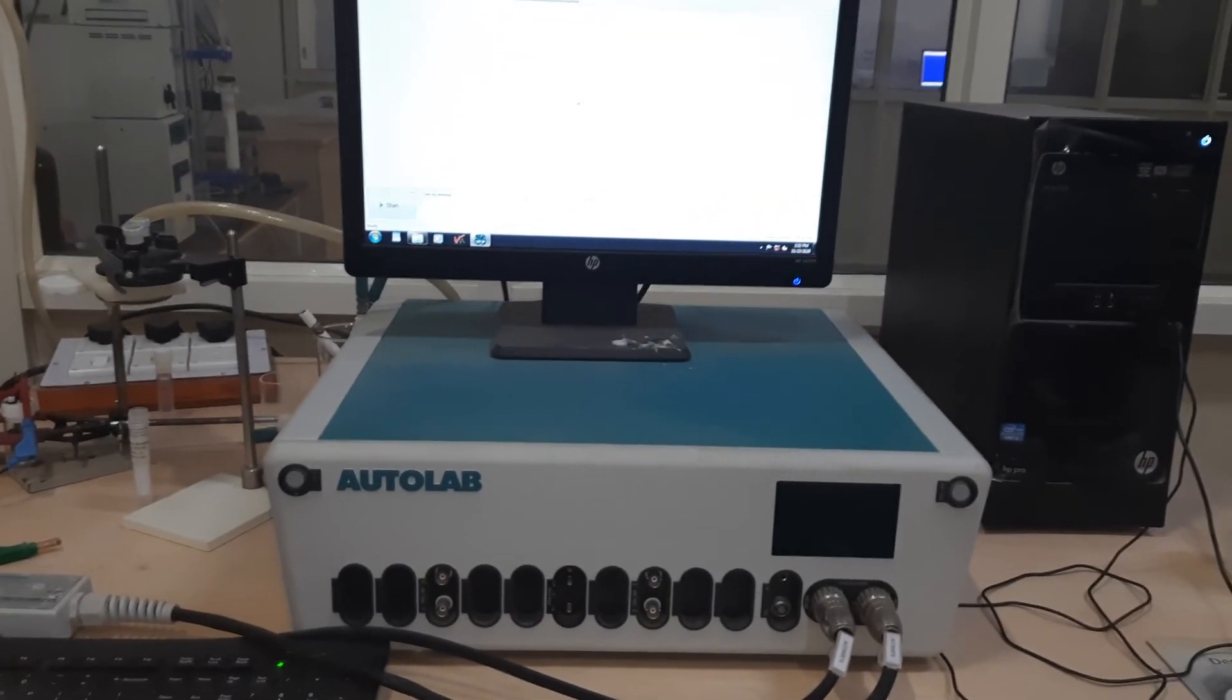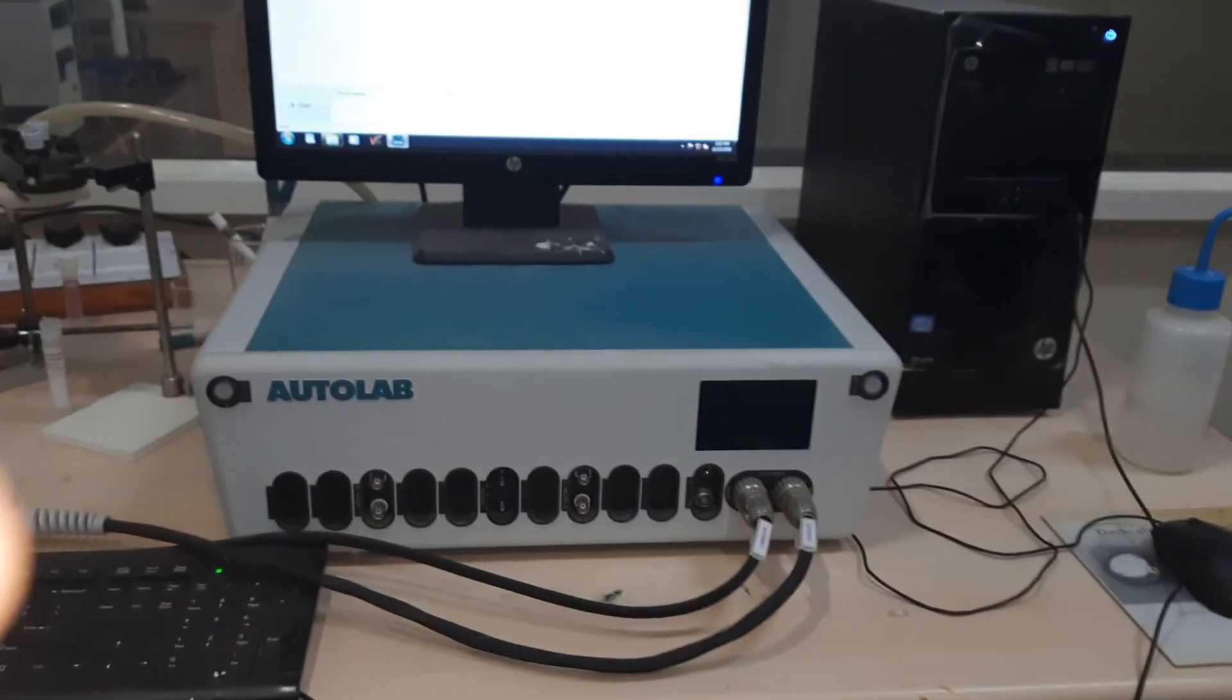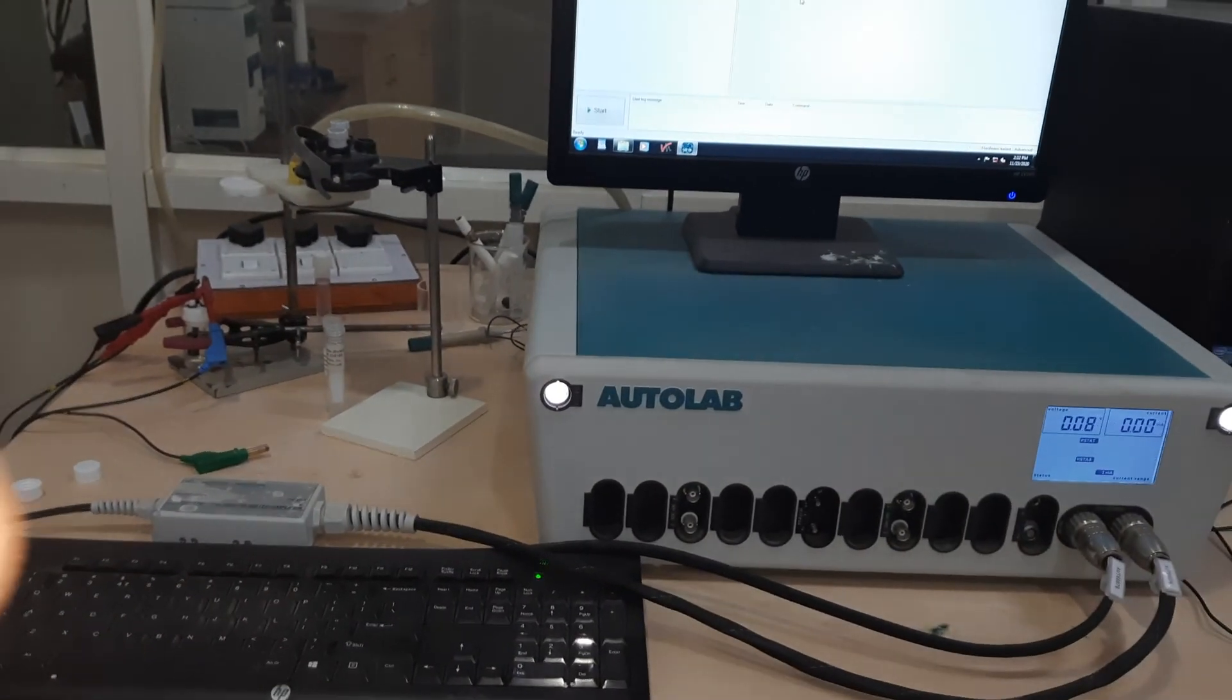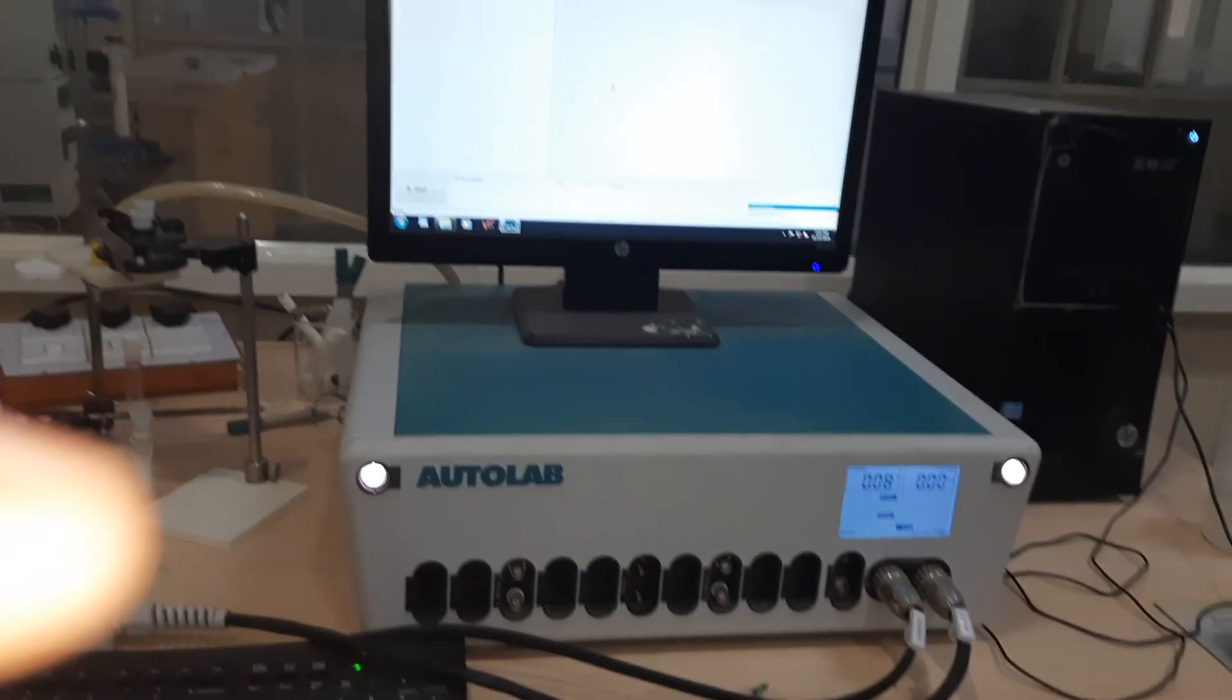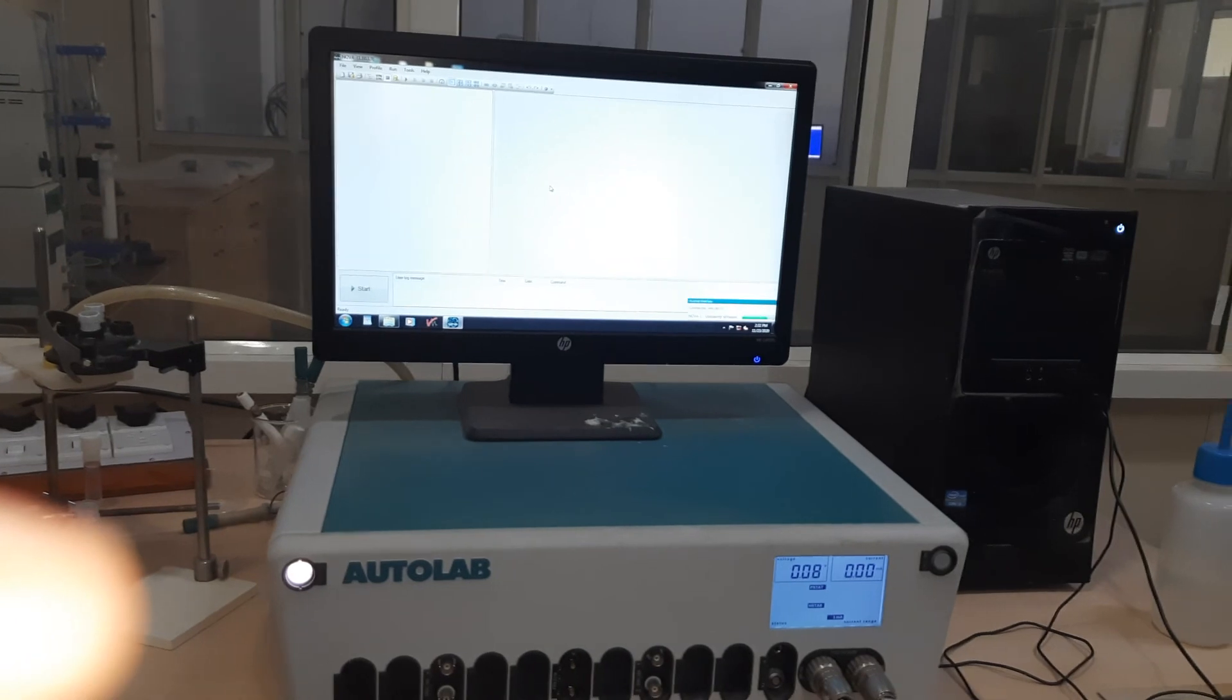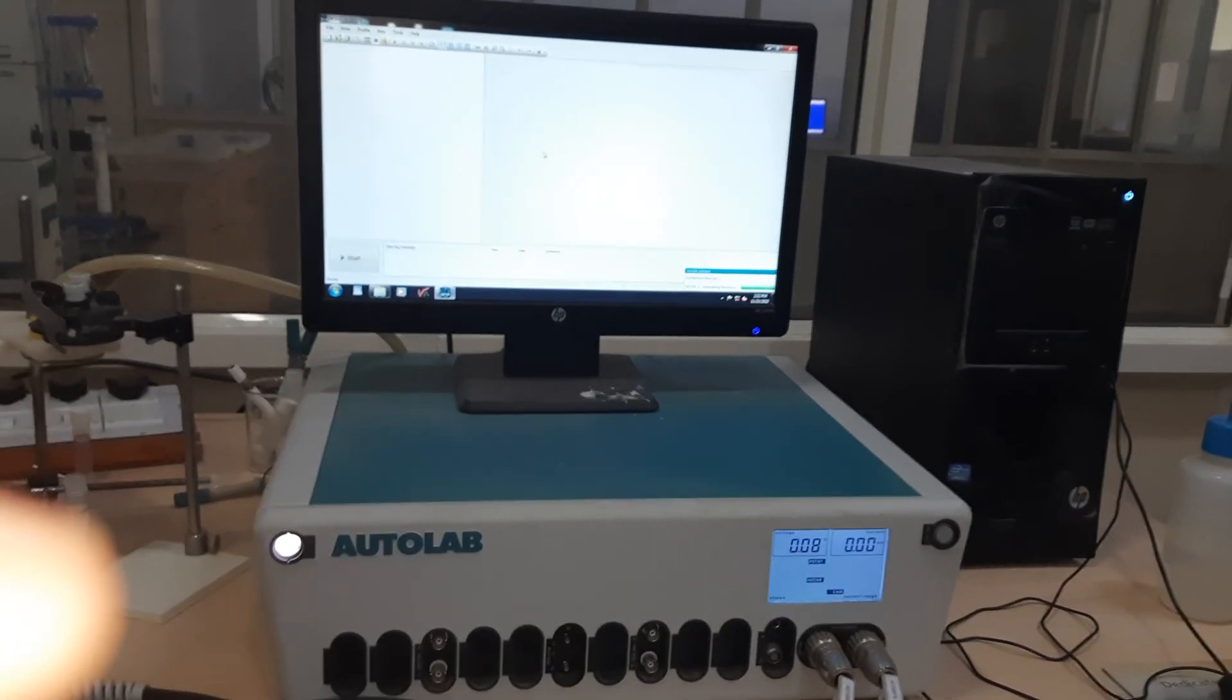Can we switch it on? Yes, first of all, this is how we switch it on. And then we need to work on the software. The shell needs to be off.